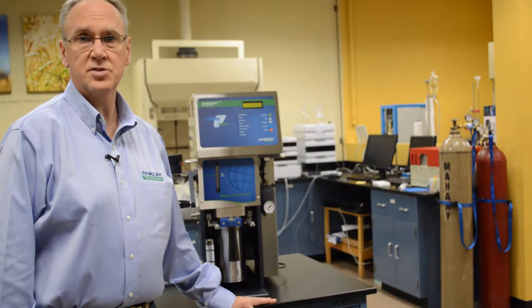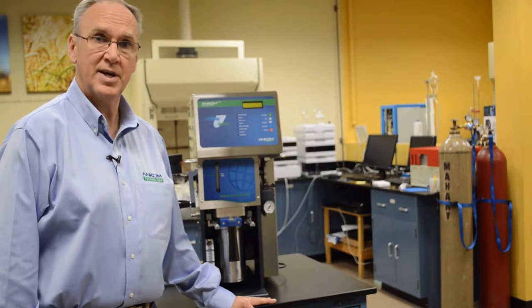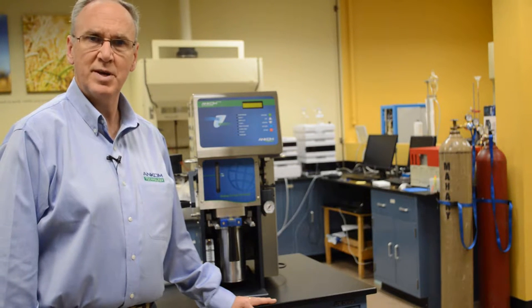The XT15 is a closed system solvent extractor that can extract up to 15 samples at a time. It reduces the extraction time by heating the solvent above its boiling point, reduces your solvent usage by up to 97%, and requires minimum bench space. In most cases, it does not require a fume hood.